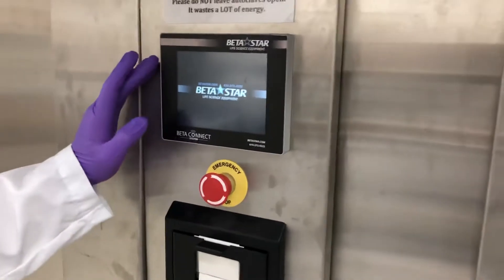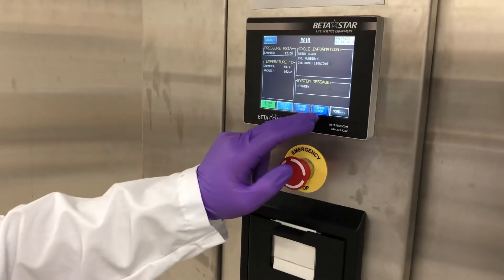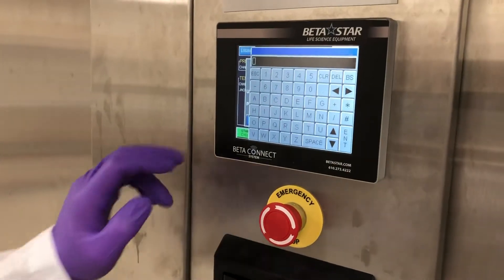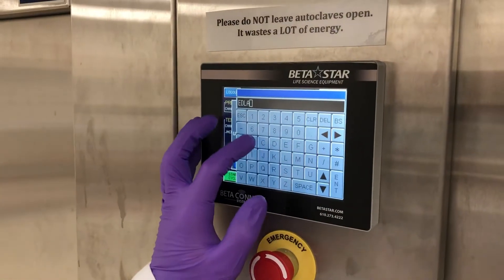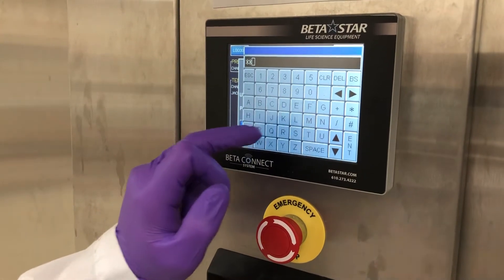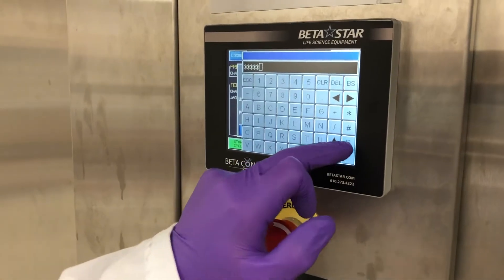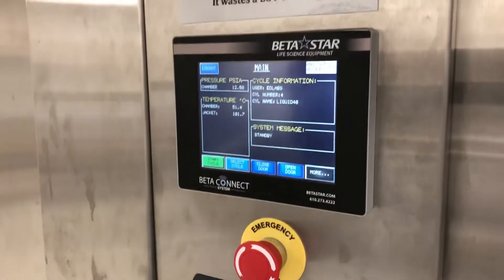Let's open this — it's a touch screen. You first need to open the door, and now you'll be challenged for classroom credentials. It's Ed Labs. Enter, then CCGS2 — that's Cell Genome Size 2. Enter, and then log in, and you'll be able to open the door.